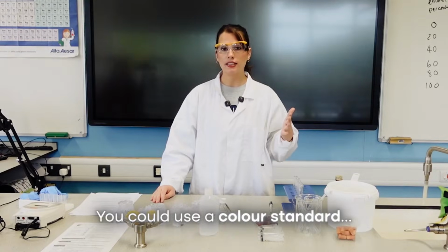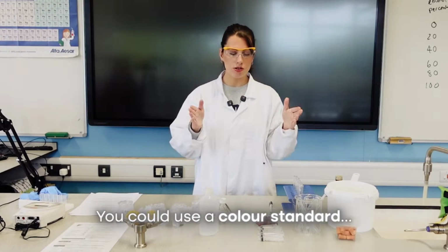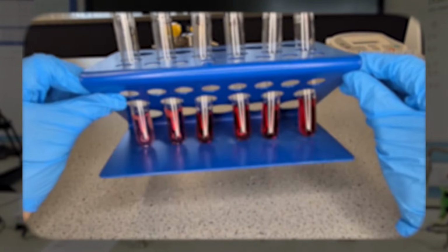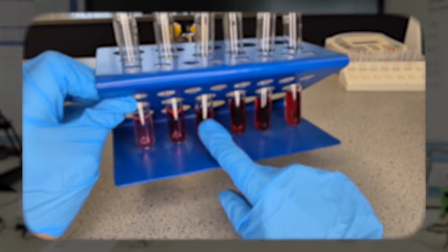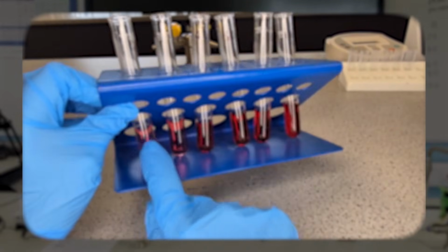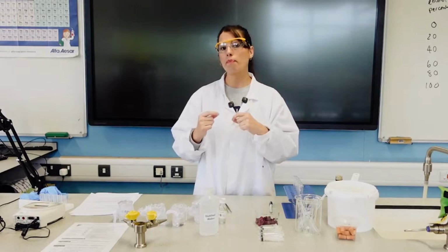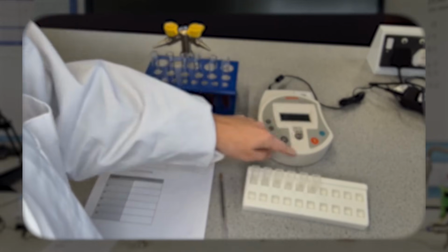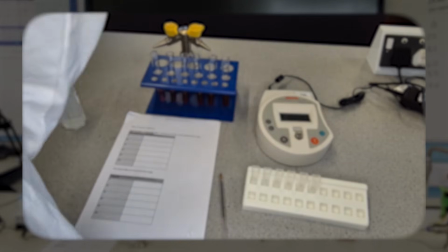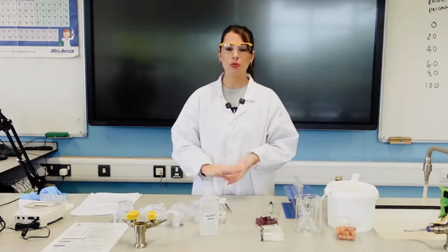You could use a colour standard where you prepare known concentrations so you can see how intense that colour looks and compare the colour of the two test tubes. That is still qualitative results though, and it's still subjective, even though you have got the comparison to help standardise. So even better would be to use a colorimeter, because that will turn our qualitative results, the description of the intensity of the colour, into a numerical value, which is our absorbance of light through the sample. So that's the version we're going to be doing.